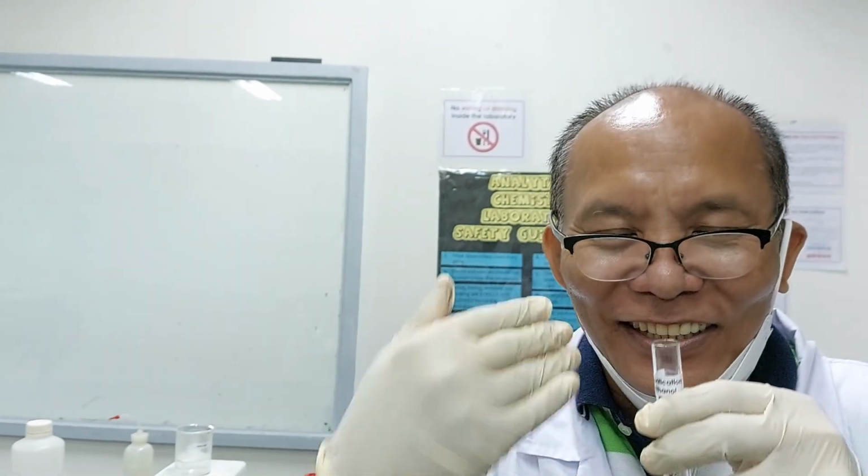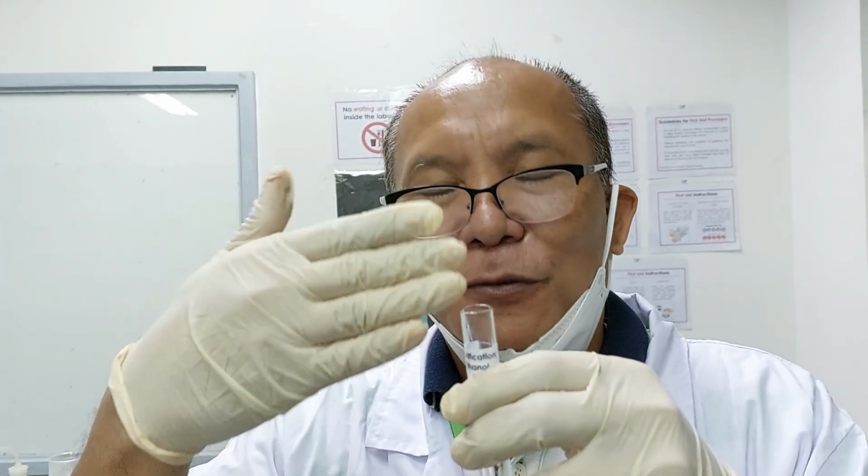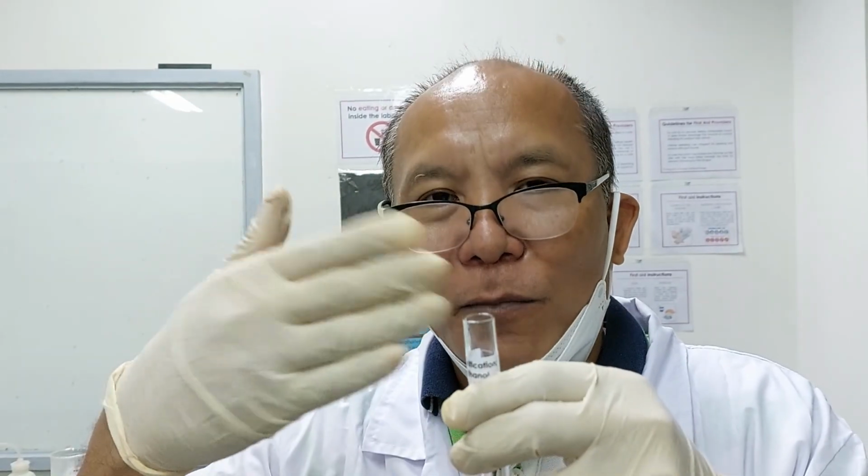Ma'am Laika, so that there is no bias. Ma'am Laika smelled all of the ester. It should be like that when smelling chemicals. It should be quite far from your nose.